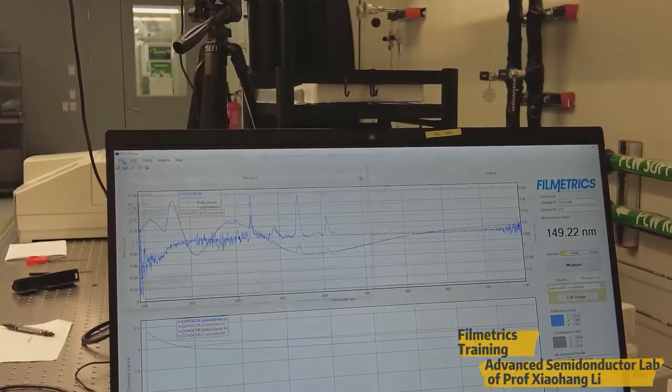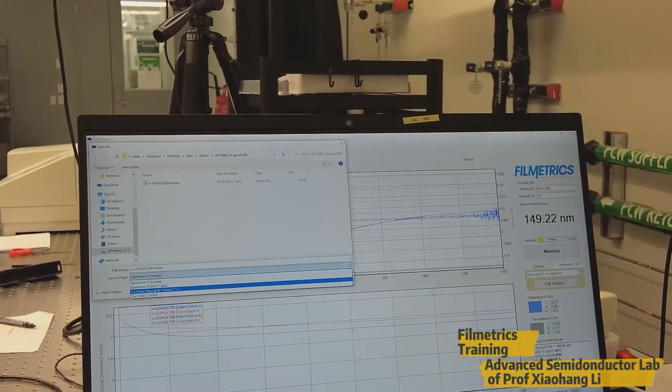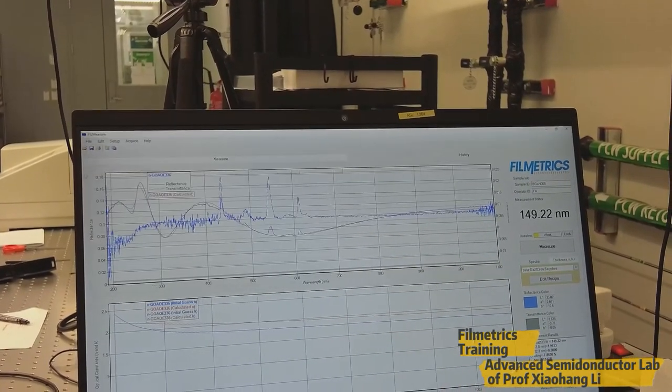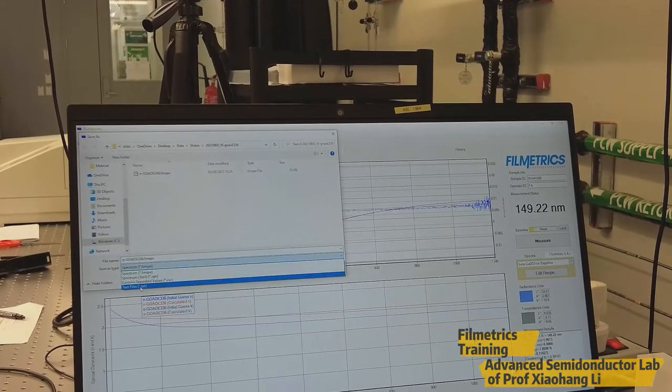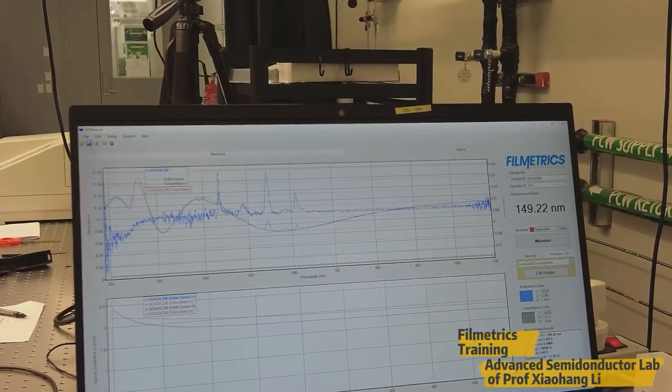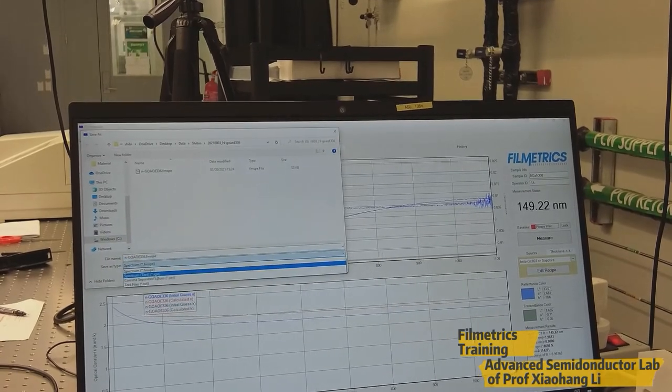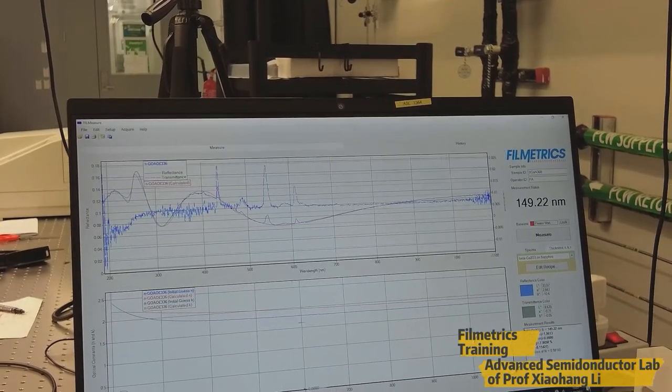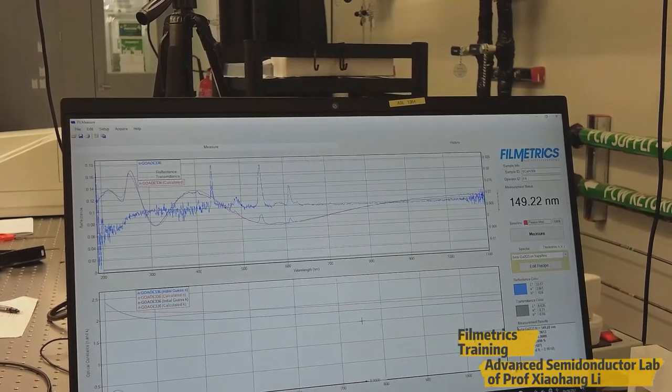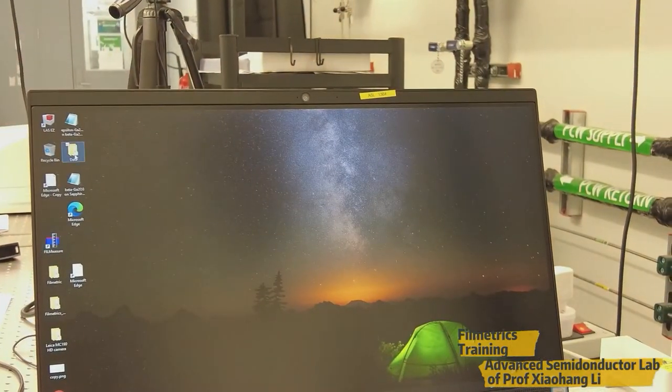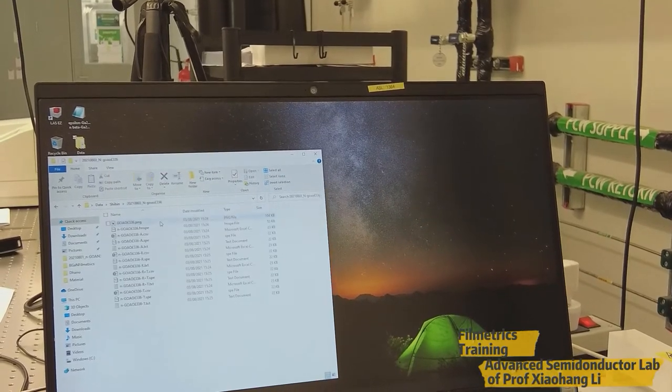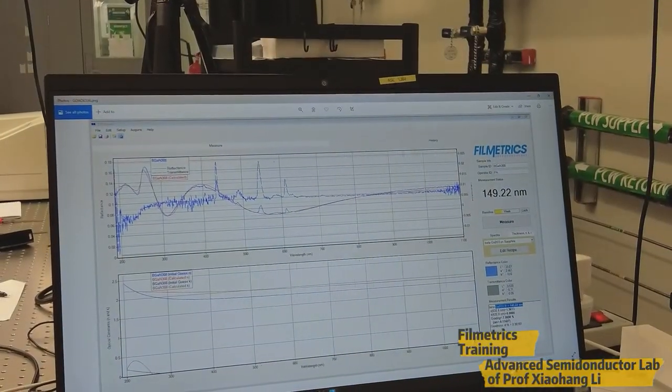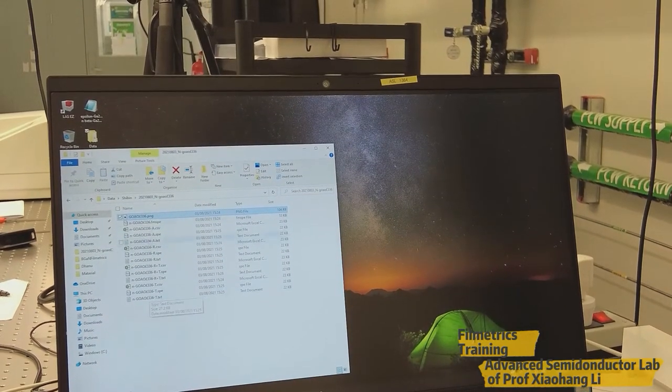Also you can save in different formats like .csv file, text file, as well as in .spe file. So the data is saved right now. You can see it from here in the data, date modified, latest one. This is the image file and other formats also you can see it from here.